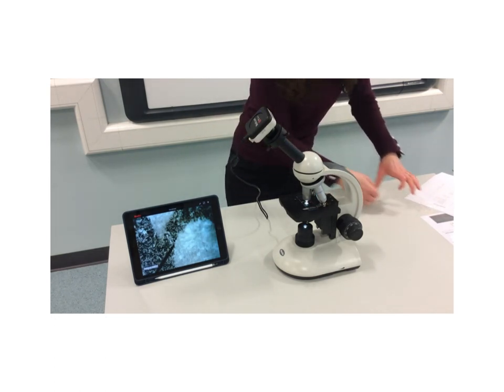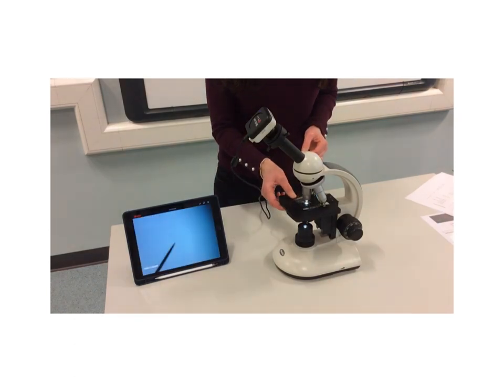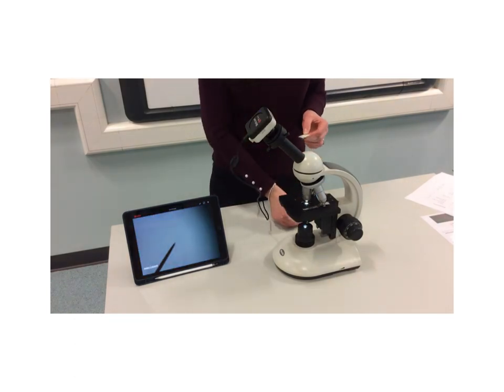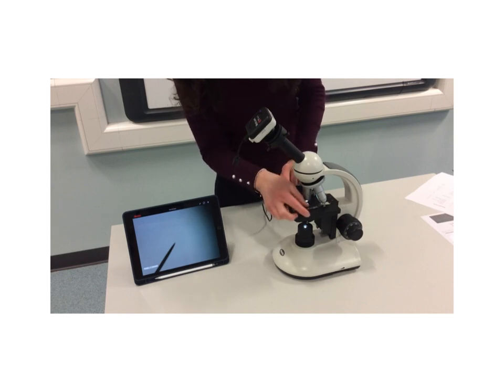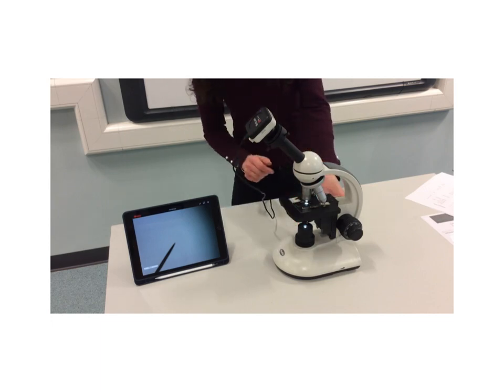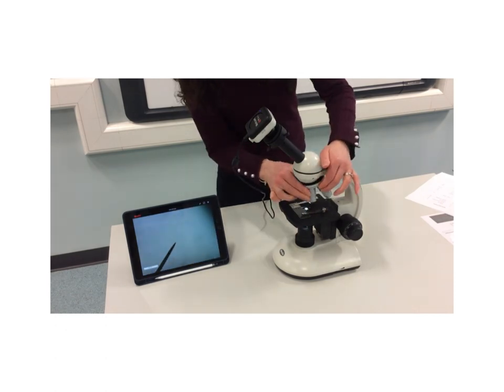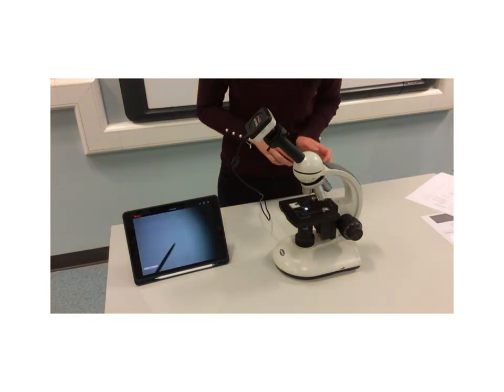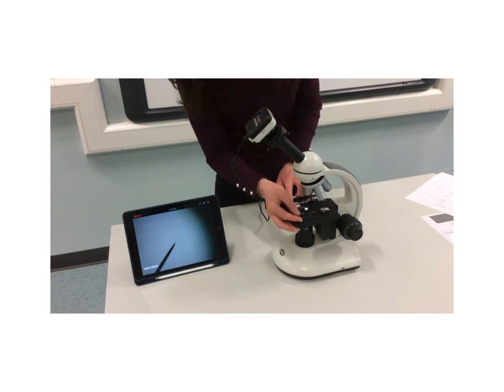We're going to have a look at another couple of slides. The first one we're going to have a look at here is a slide of a moss leaf. I'm going to use it to help you see what happens when we move the slide about. Before I put that directly on, I'm going to wheel this right back down again, and we're going to start at the low power lens, because remember, when you're starting to view an image, you always start with the low power lens.